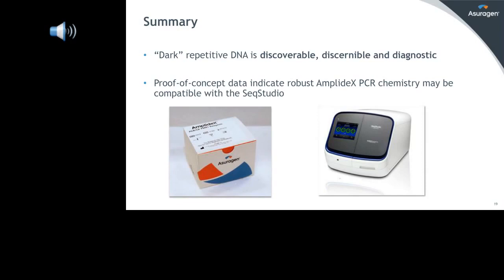PCR can be anywhere from an hour to a few hours, depending on what the target is and what the goals are. You take that product, you can dilute it directly into high dye. You don't need to clean it up. And then add in your ladder and inject, and then run it on the instrument. And again, in one of our cases with a TOMM40 assay, we ran as short as 20 minutes. So this means that our hands-on time is minimal, less than an hour for all of these assays.